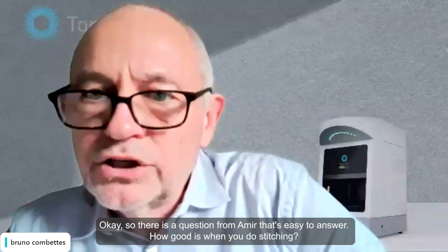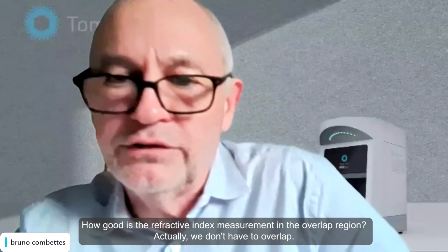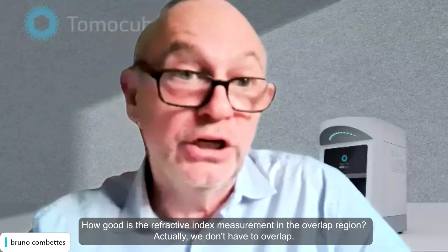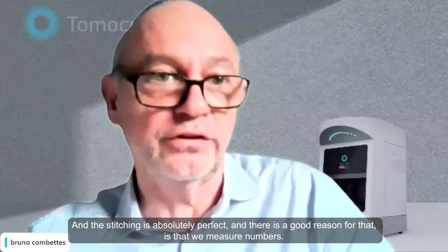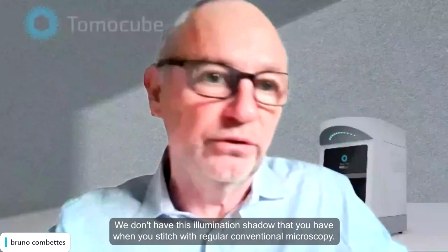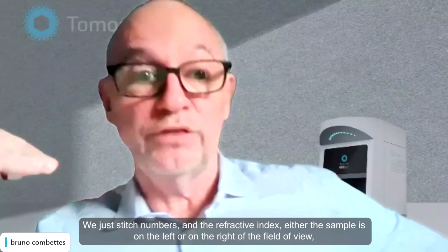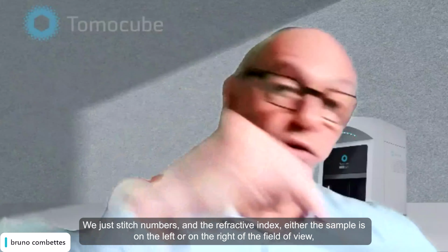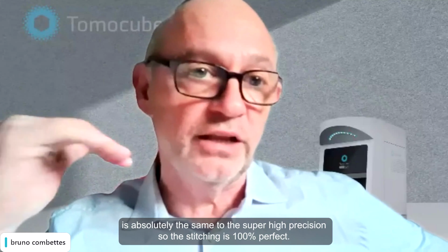Okay. So there is a question from Amir that's easy to answer. When you do stitching, how good is the refractive index measurement in the overlap region? Actually, we don't have to overlap, and the stitching is absolutely perfect. And there is a good reason for that: we measure numbers. We don't have the illumination shadow that you have when you stitch with regular conventional microscopy. We just stitch numbers, and the refractive index, whether the sample is on the left or on the right of the field of view, is absolutely the same to super high precision. So the stitching is 100% perfect. You can't tell how many tiles you've stitched after the stitching.